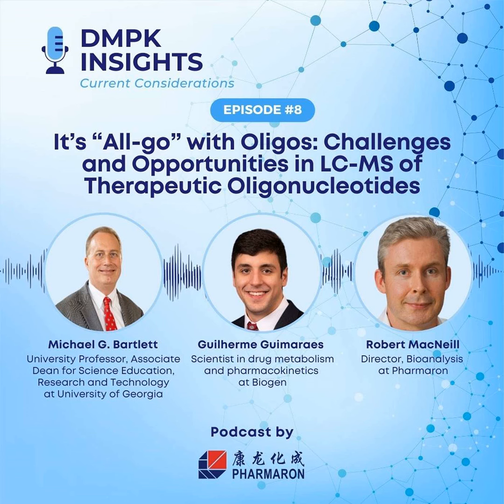Yeah, I mean, I think HILIC is definitely going to have a significant future here in oligos. And it's one of the things that they've alluded to early on here, is it's really, I think, going to be your core facilities and your CDMOs that are supporting the drug development that it's really going to be such a big improvement for. I think the oligotherapeutic companies are less concerned about dedicating instruments to ion pair reverse phase chromatography because they're not analyzing any other type of analytes there. But the CDMOs and your core facilities at universities, they don't have that luxury, and they are not going to play well with the people that want to do ion pair reverse phase on their instruments because they don't have a week to clean their instrument out after they do your experiment there.